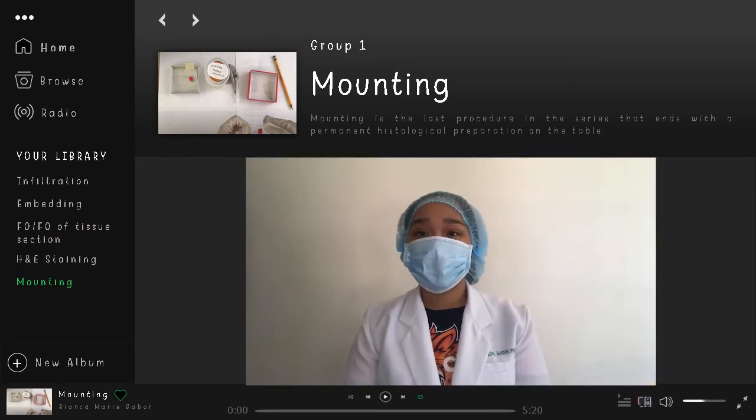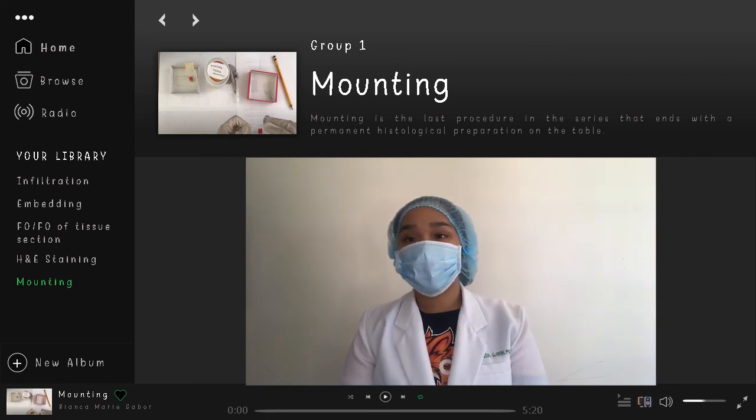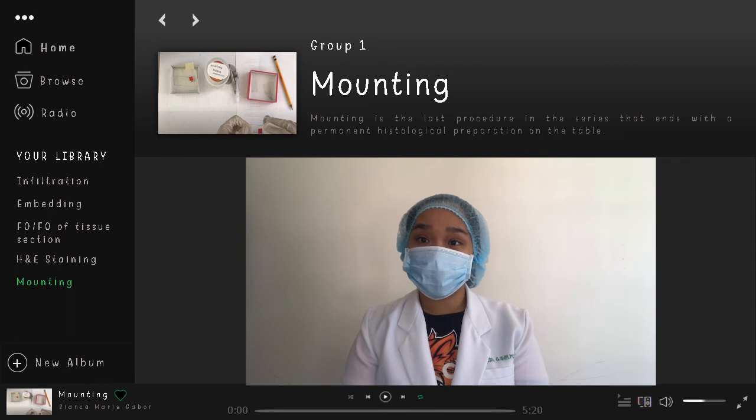Remember that if there isn't enough mounting material, air bubbles will form around the borders of the cover slip, making it tempting to press down to achieve a tight seal. However, this pressure can crush and deform the sample's 3D structure. It's best to apply enough mountant to the cover slip to avoid pressing it, because if we apply too much mounting media, it would become sloppy and displace the samples, making it impossible to image.